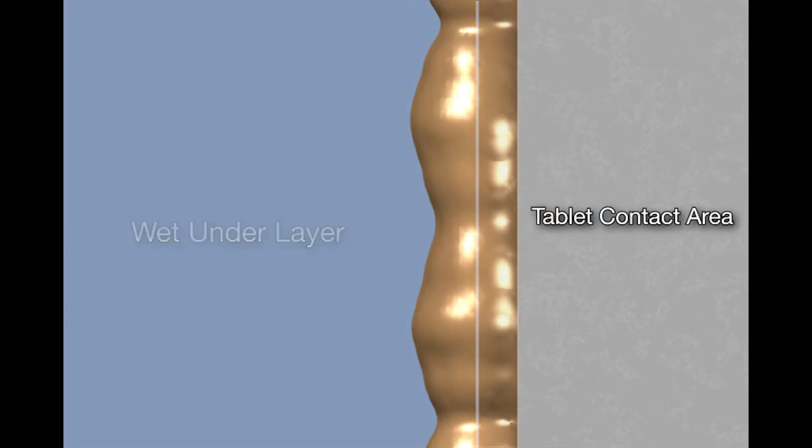Once the solvent is evaporated, a solid film is formed on the surface of the tablet core.